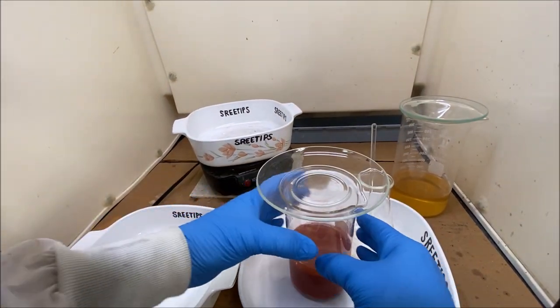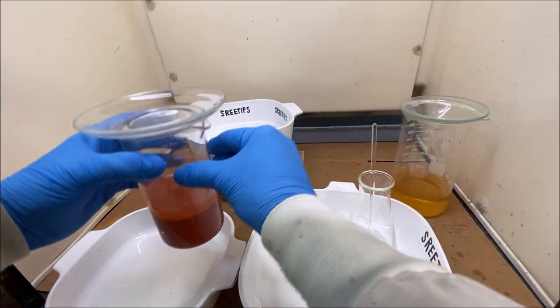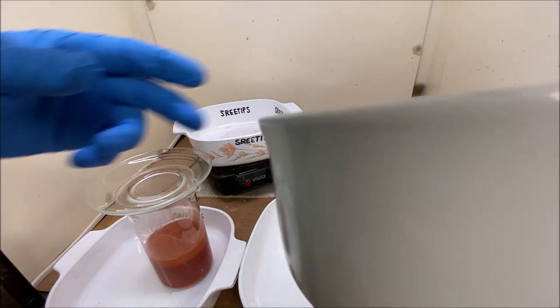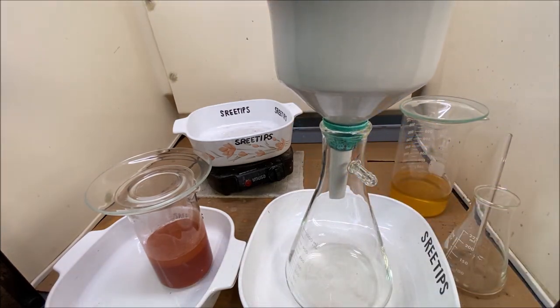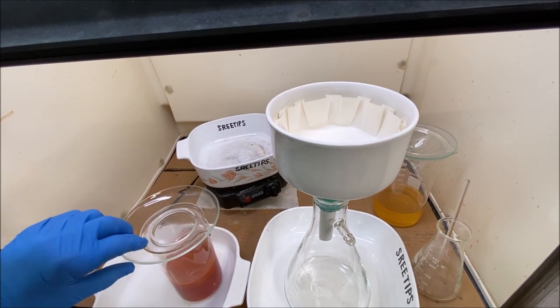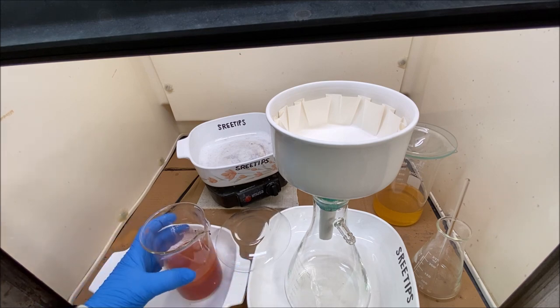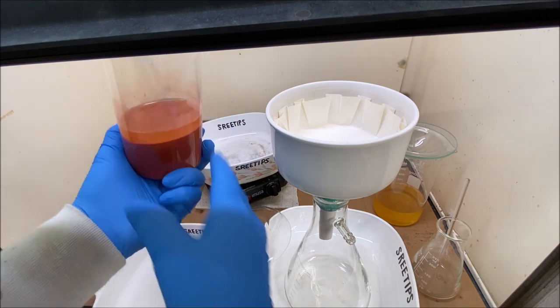It also proved that the hydrochloric acid will not put the precipitate back in solution. Now I've got a filter here and what we're going to try to do is capture the precipitate in this filter - just going to pour it right on in.